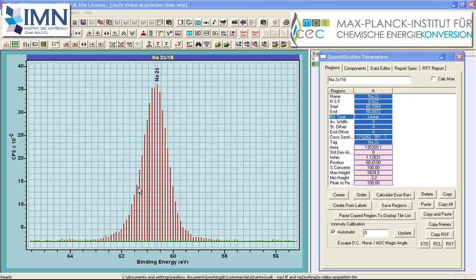And this is significant because the uncertainty with each one of these data bins is the square root of the counts per bin. So although the photoemission peak may represent a significant number of counts, the individual data bins themselves do not, and therefore by virtue of the noise being proportional to the square root of the counts per bin, the individual data bins will be far more influenced than the total of all of these data bins when integrated, and hence we use the area to represent the intensity of a photoemission peak.